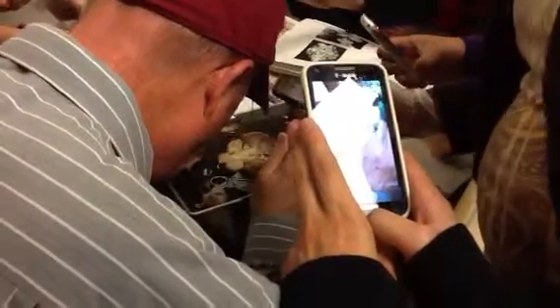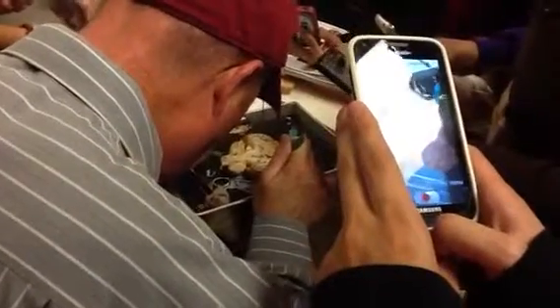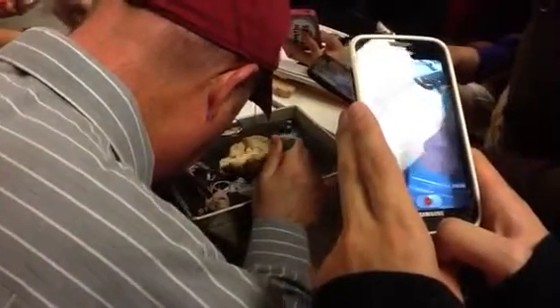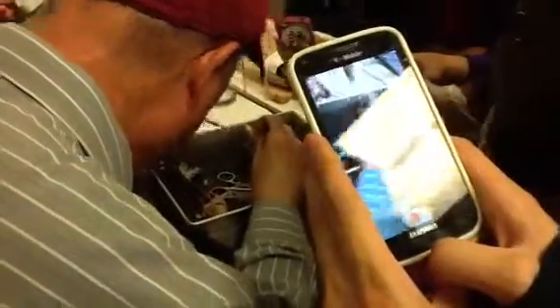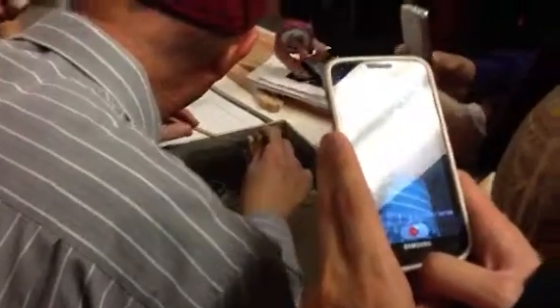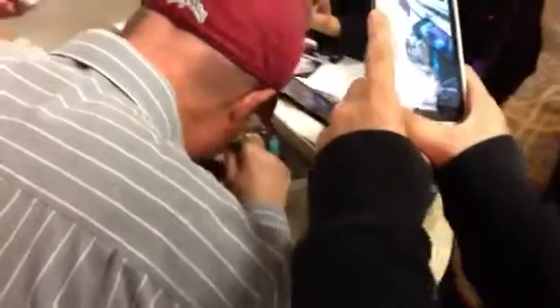Okay. See, I would confuse that with the pons. Now the pons is the big thing. The pons is right here. It's this big bulge here. That's the pons. It's a bulge. Okay, what else do we have? The thalamus is right there. I mean, the thalamus.